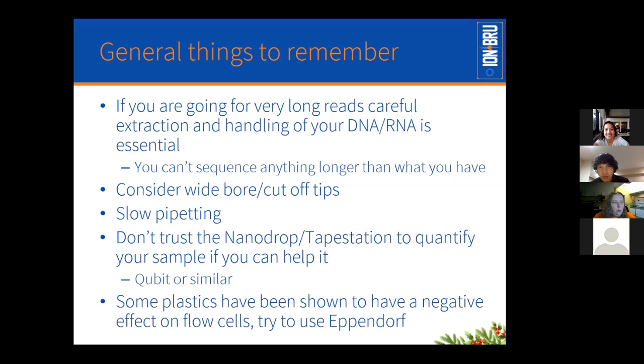You might want to consider wide bore pipette tips, or even just cutting the end of your pipette tips off with a blade, just because the smaller hole will shear your DNA more. And also do your pipetting quite slowly. It can be a bit frustrating doing it super slow, but it does help.